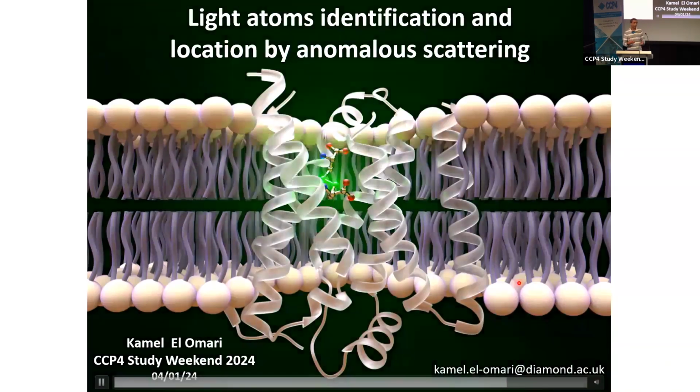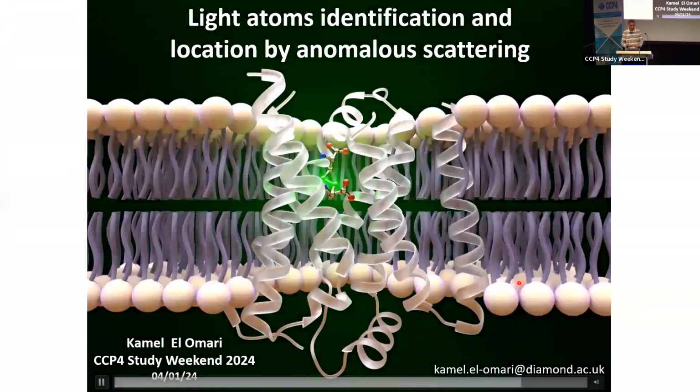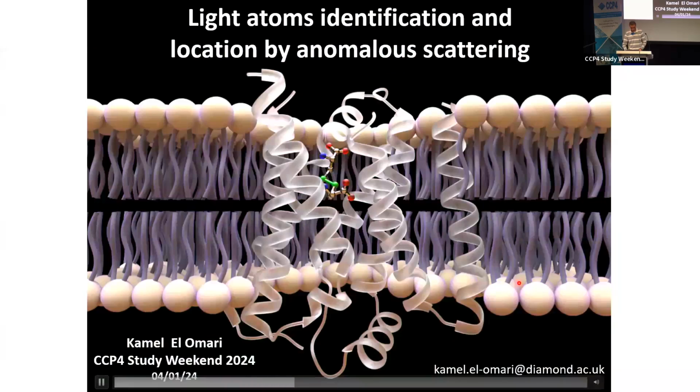So this session is about model building, and I'm hoping to show you that actually you can use anomalous data to help you with your building or get a better structure and be more confident about the data that you deposit.